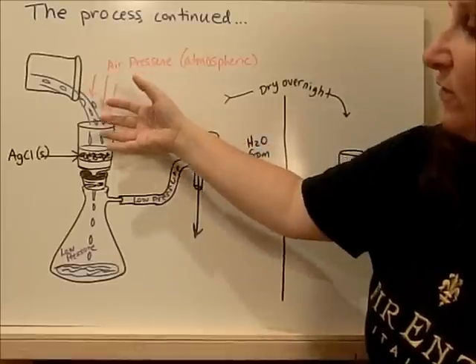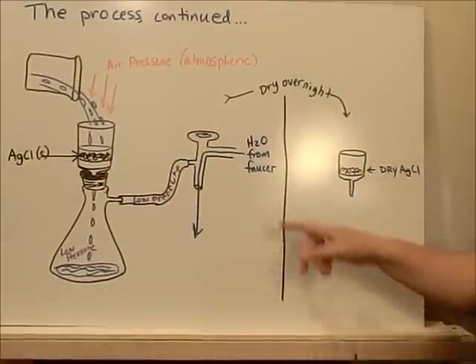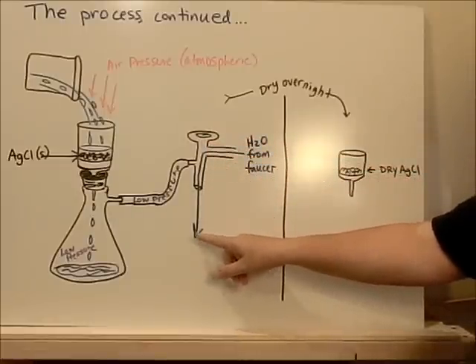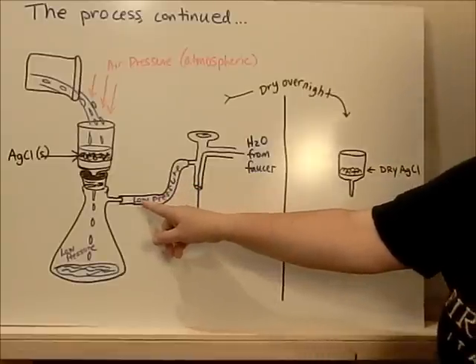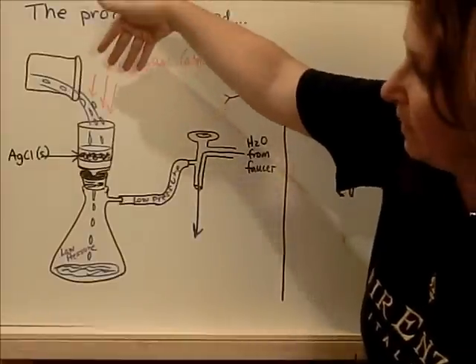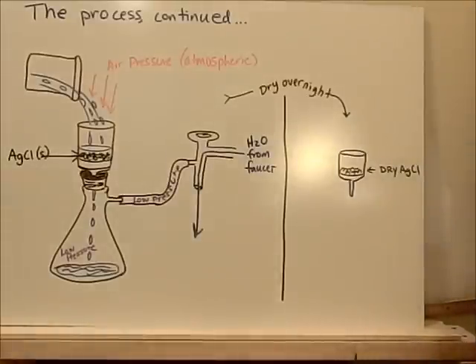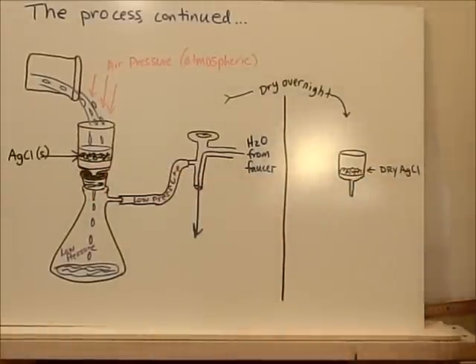And then it's just a filtration. It's kind of like a pressure device. And here's how it works. Here's your faucet, and running water goes through the faucet, creates a low pressure zone. So if you hook a tube up to that, that low pressure gets transferred into your suction flask or your sidearm flask, and air pressure from above literally pushes that liquid through. Otherwise, it simply takes too long to drip this through such a fine porous crucible like the Gooch crucible.